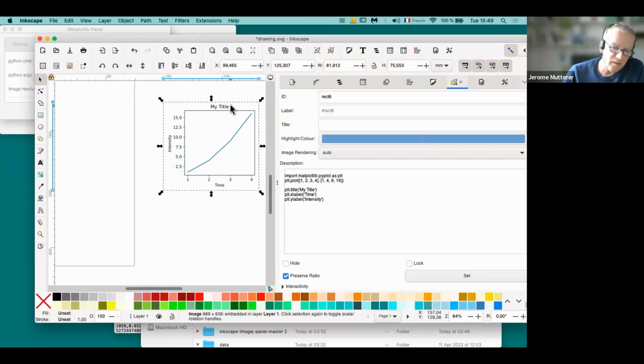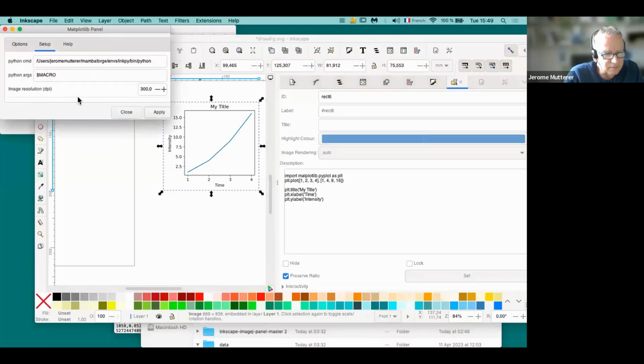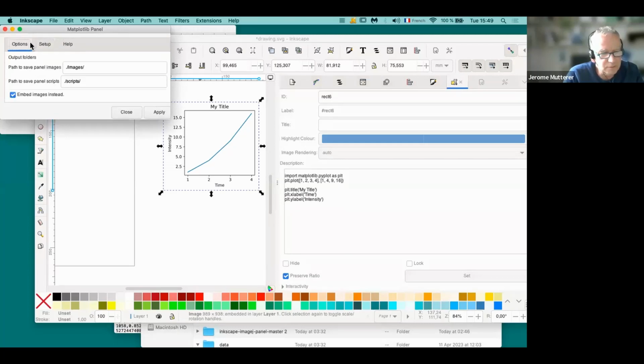Yeah, it makes sense, but it would definitely make sense to sometimes have the option to use a full SVG. This is very easy. We've done this with Martin, because embedding SVG inside SVG is even easier than embedding images. So maybe we will put this as an option, because each extension has a dialog with options that we could enrich with options that would make sense.